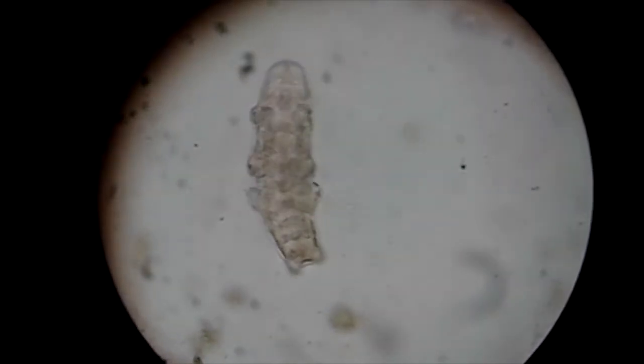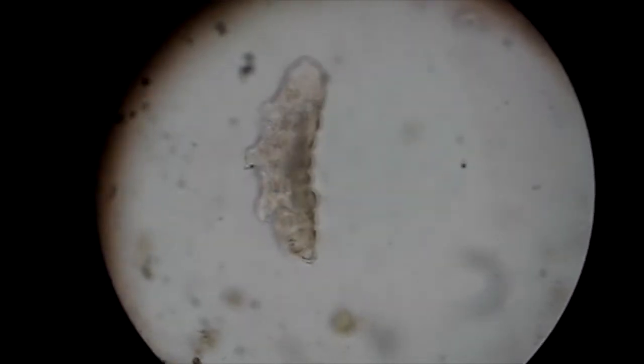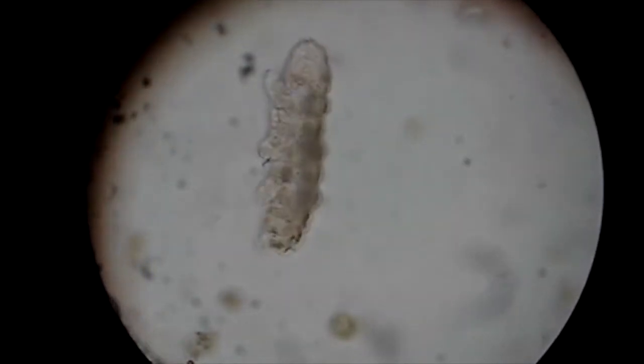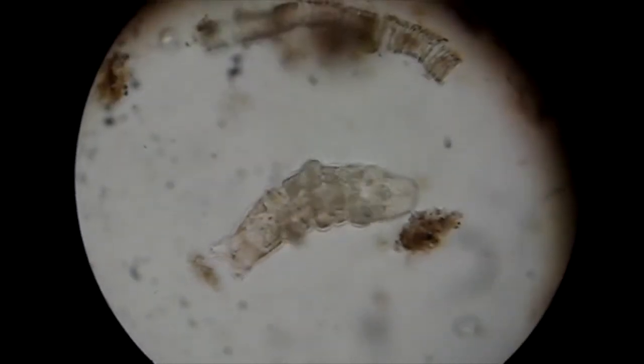Okay, this is what you've probably all been waiting for, the tardigrade, and this is how I first saw him, low power. Zoomed in, and you can see the eyes there. It was really nice, because I've only ever seen a couple of these in my pond, and I put this slide under the microscope, and the first thing I saw when I looked down into it was that low power footage that you saw at the beginning, where I spotted him, and I was like, yeah, I've got the tardigrade.